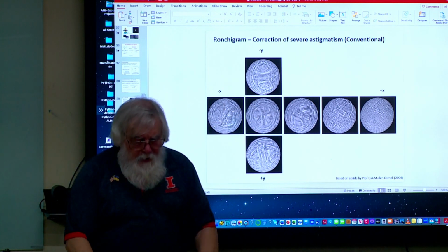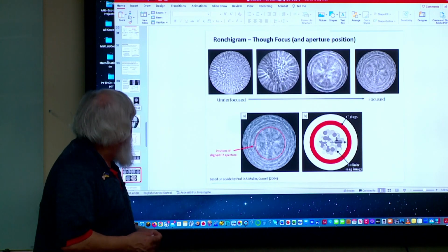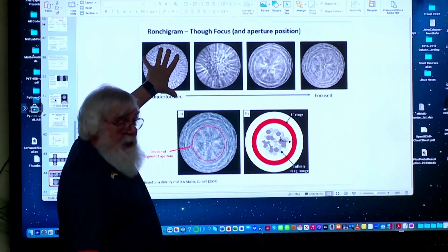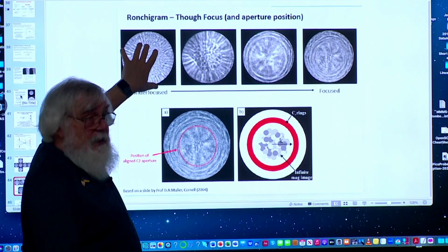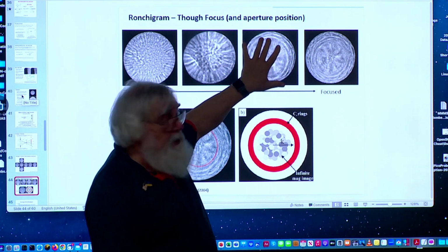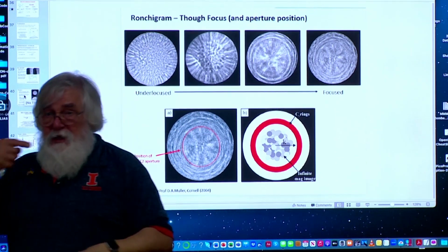See if there's another one. I don't think I have a better example of that. Oh, yeah, here we go. As we go toward focus, you'll see an image here. You actually have an image of your sample. Even if it's crystalline, you'll see something. And as we go through focus, this thing will begin to blow up, and you'll get to what's called the infinite magnification site. The only way to demonstrate that is to actually see it in line.